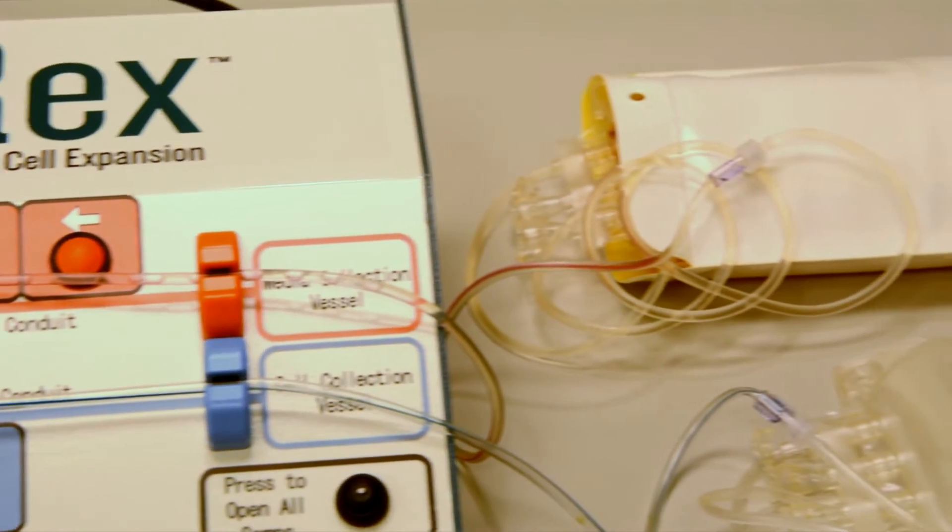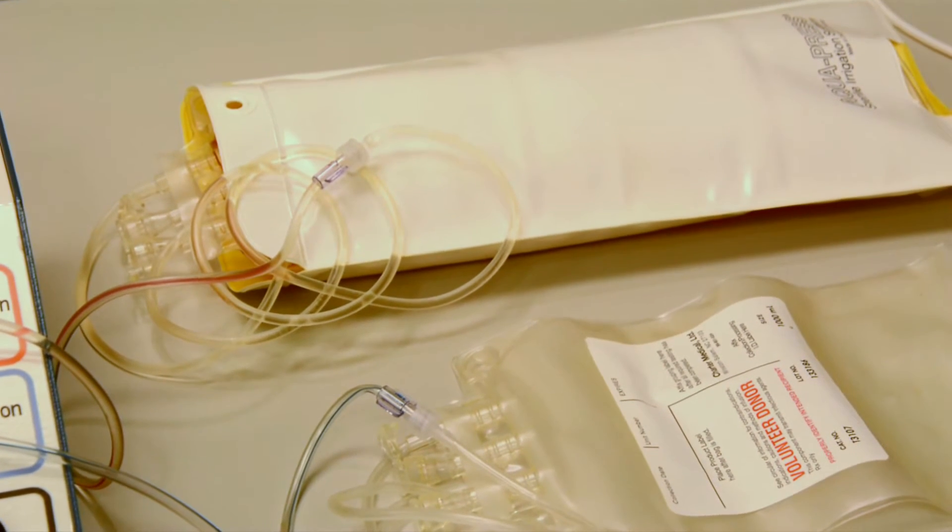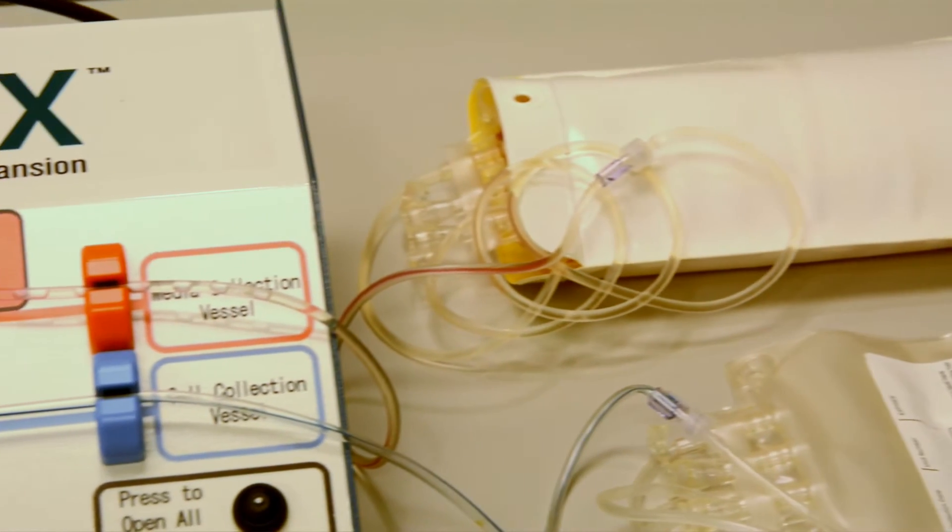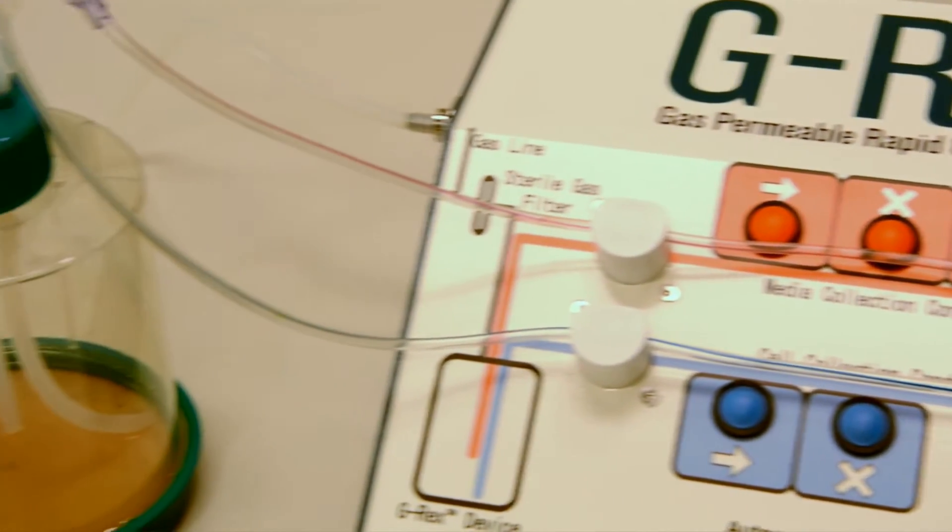This is the collection bag at the end of the process, leaving in the G-REX a residual volume of only 10%, in this case 100 milliliters, which we can then use to resuspend the cells.